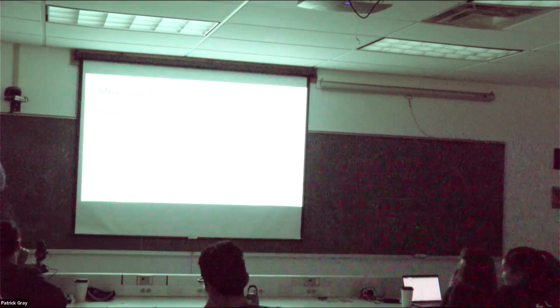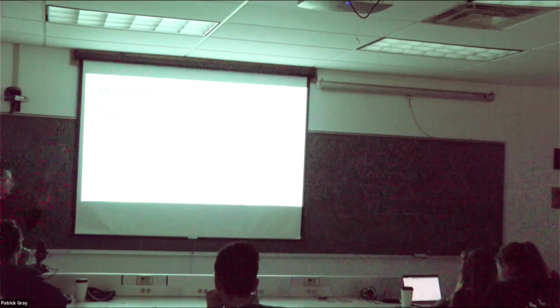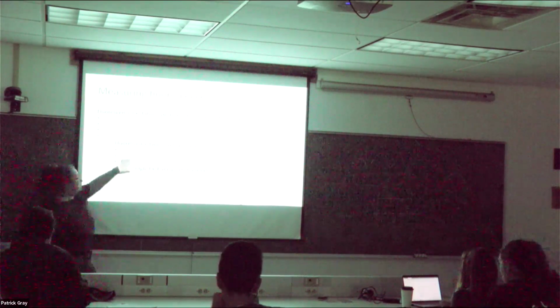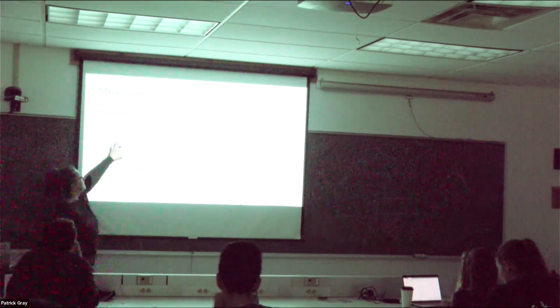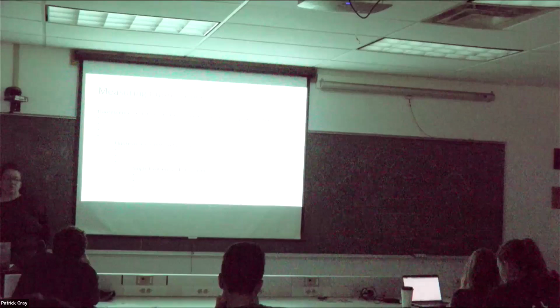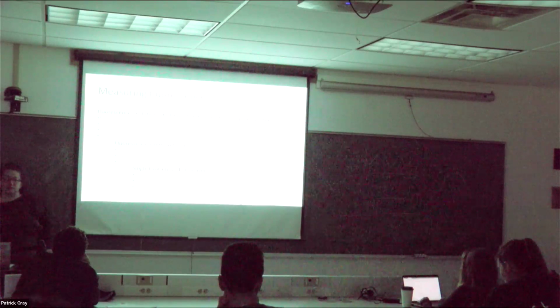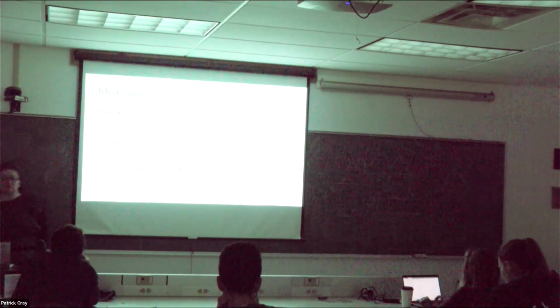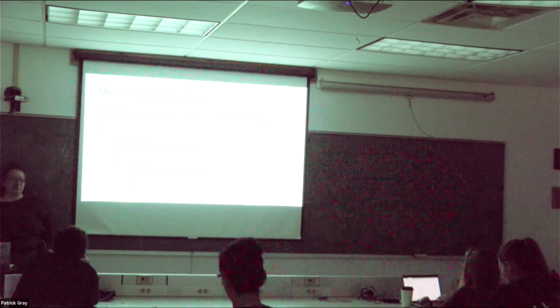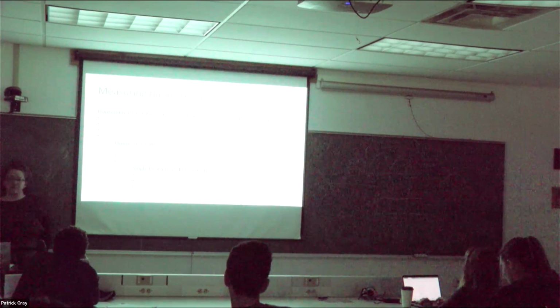I think some of the questions are going to be answered as we go. Single excitation emission: in theory, you excite at one wavelength and you measure at a specific wavelength. This is usually done after you do the excitation emission spectrum, so you already know something about the properties of the molecule that you're hunting. For example, the ECO that you used yesterday, and the ECO that you're going to be using today, and the ECO that you're going to be using for the rest of your life, usually functions on the idea that we know some chemical and physical fluorescence properties of a targeted molecule, in this case, chlorophyll.